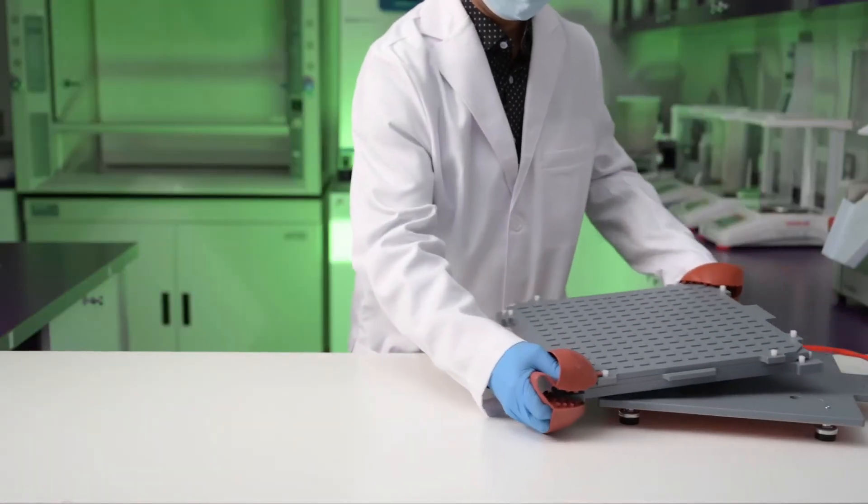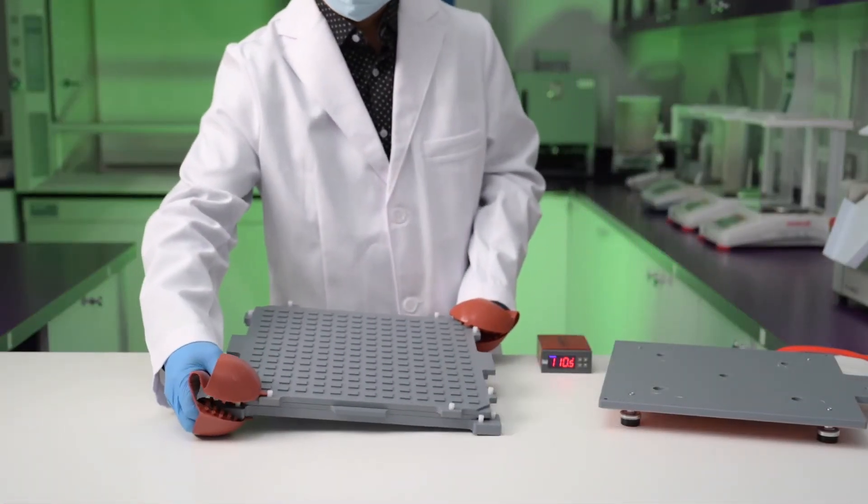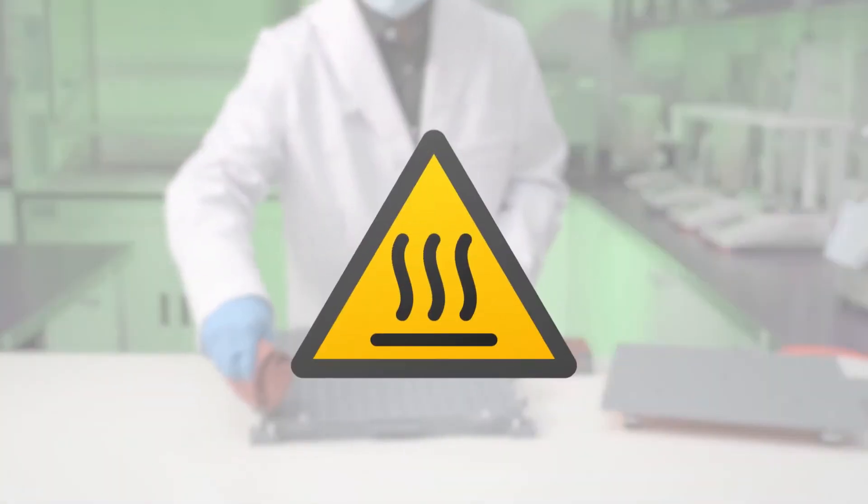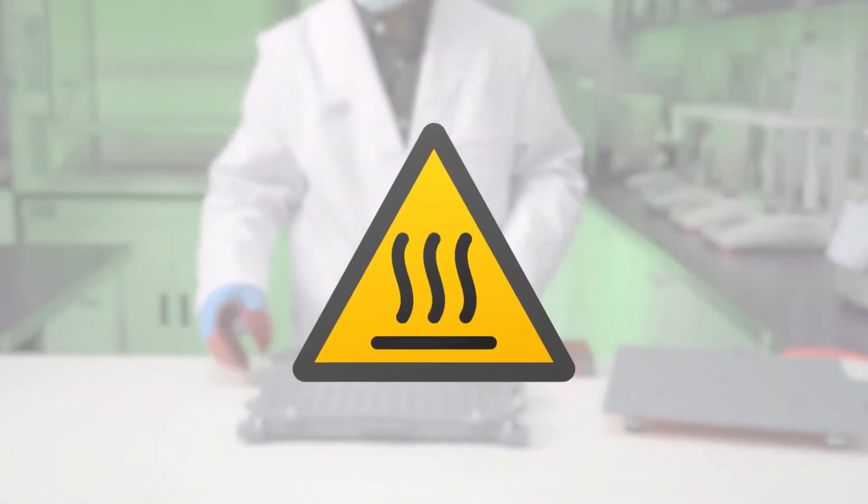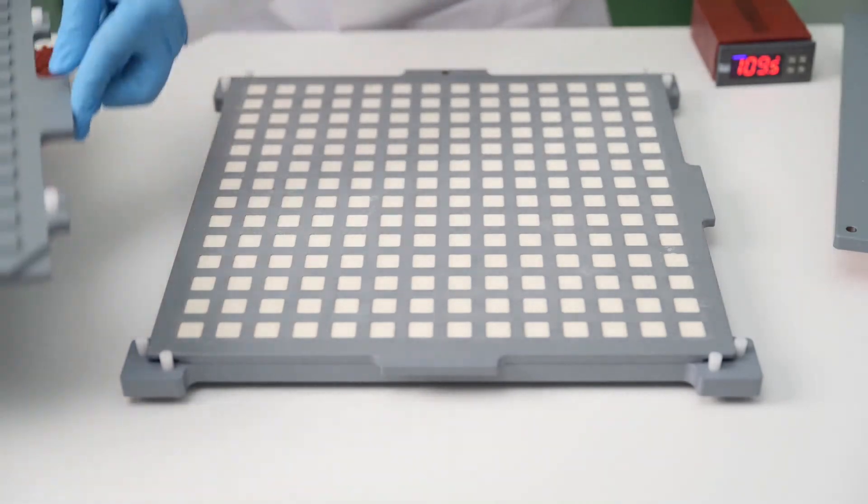Now it's time to remove the tablets. With proper heat protective labware, remove the plates from the base heating plate. Remember, it is just baked so the plates will be hot. Place the tamper plate aside.